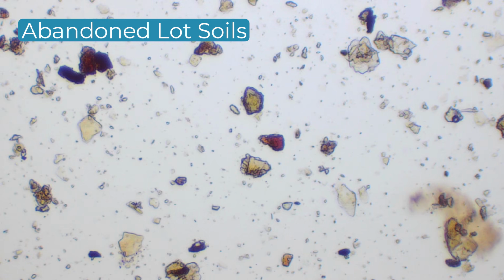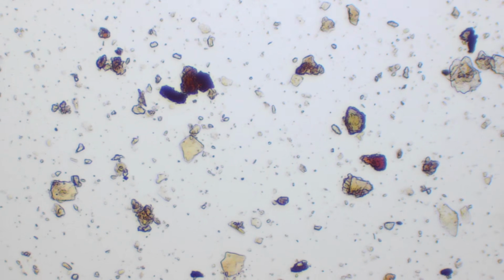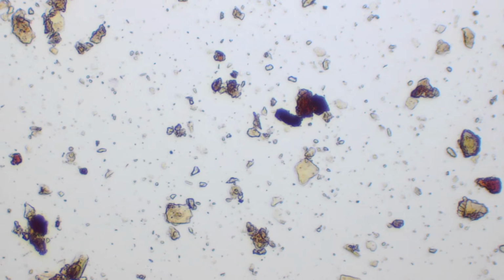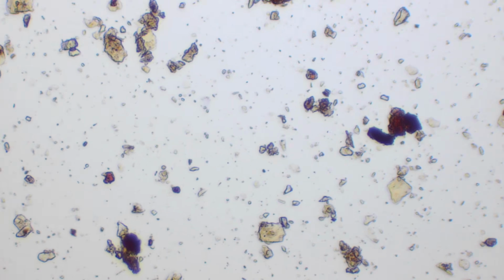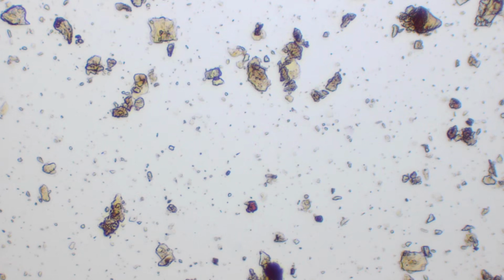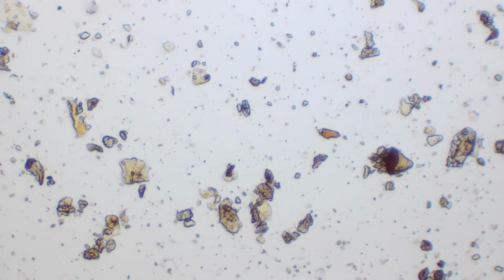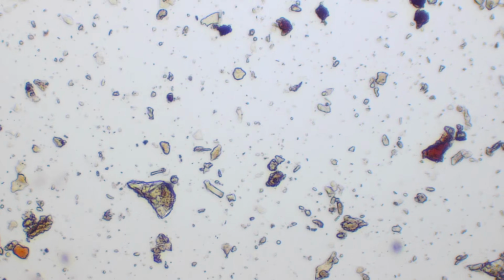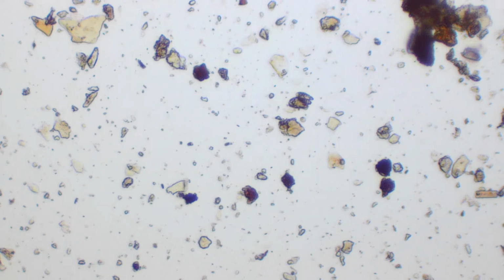Abandoned lot soils. This sample of abandoned lot soil primarily contains bacteria and minerals, with the occasional tiny piece of fungi. This characterizes a disturbed or pioneer ecosystem with low biodiversity and low ratios of fungi to bacteria. It has poor soil structure, low water retention, and low nutrients.